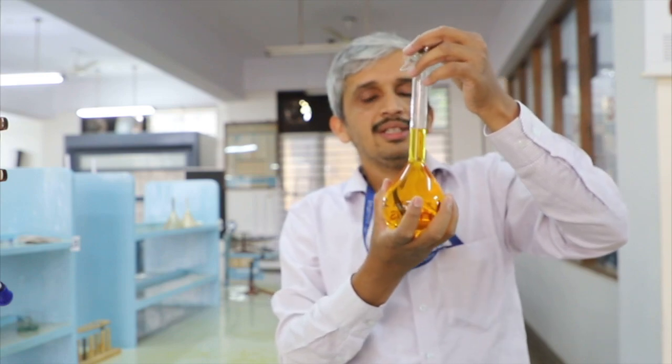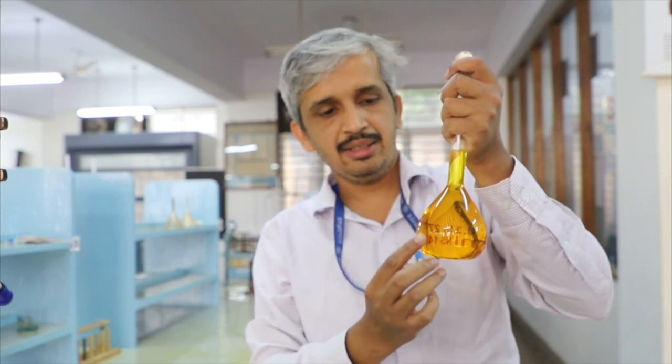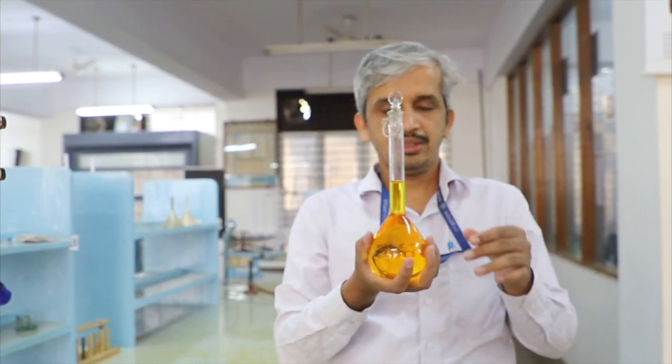So now the solution is ready, but here in the solution there is a concentration gradient. Means the lower portion of the solution is having more potassium dichromate concentration, upper portion will be having less potassium dichromate concentration. So now I have to have a homogeneous solution. To make a homogeneous solution, it should be thoroughly shaken, thoroughly mixed.